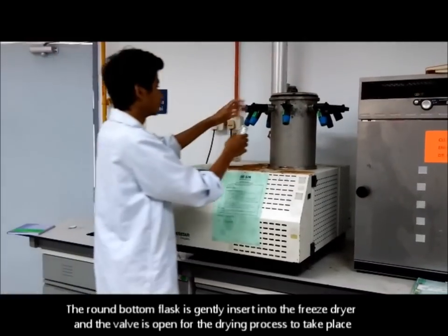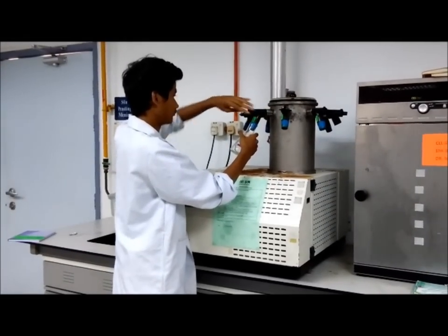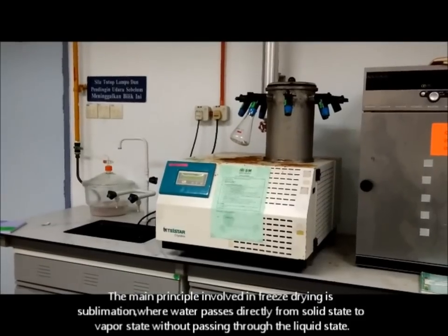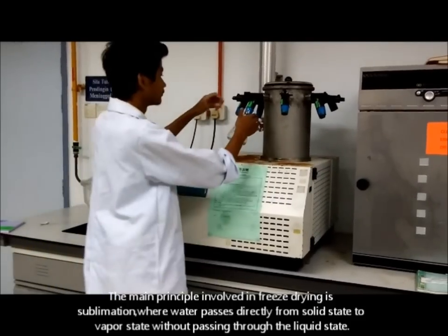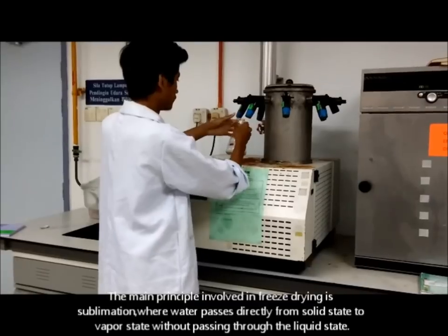The freeze dryer valve is opened for the drying process to take place. The main principle involved in freeze drying is sublimation, where the water passes directly from the solid state to the vapour state, without passing through the liquid state.